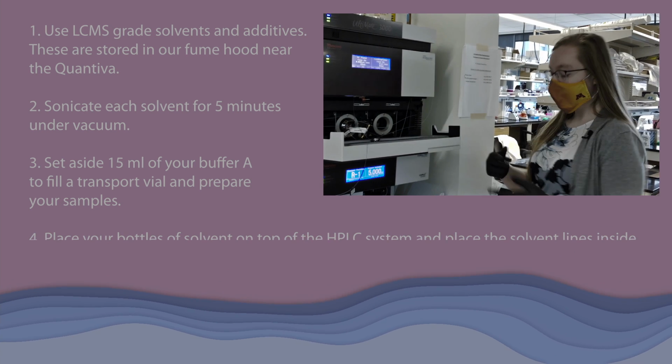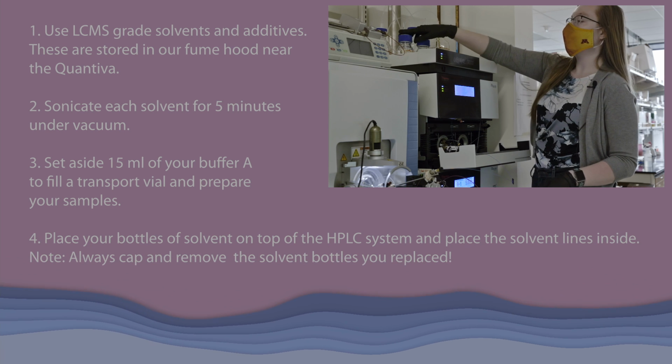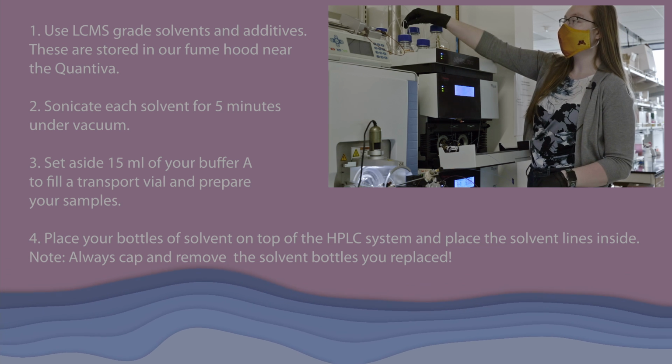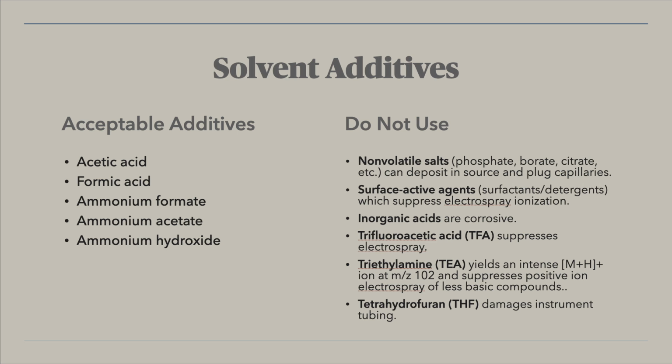So once you've done that, then you'll take your solvent bottles and bring them up to the top of the instrument and place the solvent lines in the appropriate bottles, labeled A for aqueous and B for organic solvents.